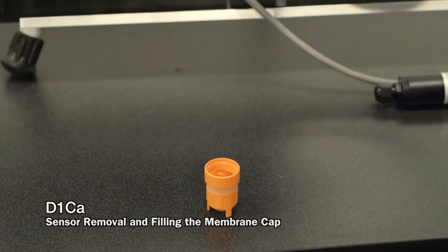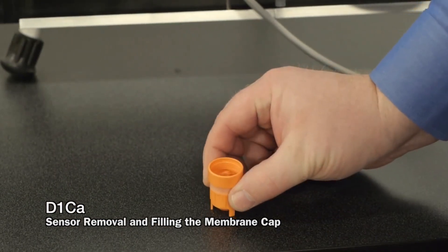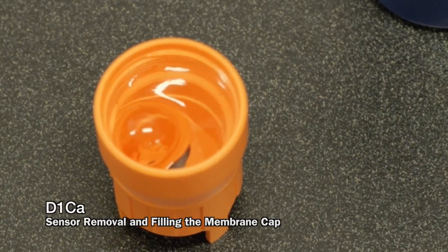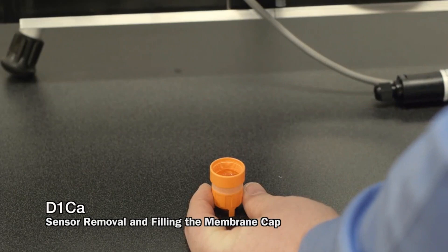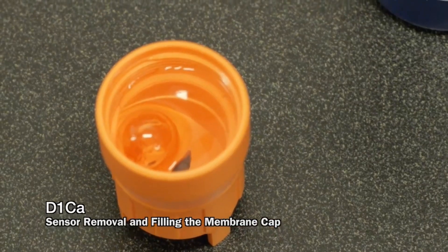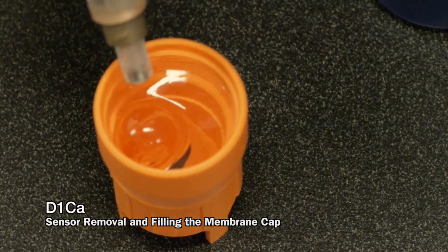If there is an air bubble, it will migrate toward the top over time. Let it come to the top on its own. Never put a screwdriver or any other instrument into the electrolyte. If you want to help remove an air bubble, use the sensor tip itself.